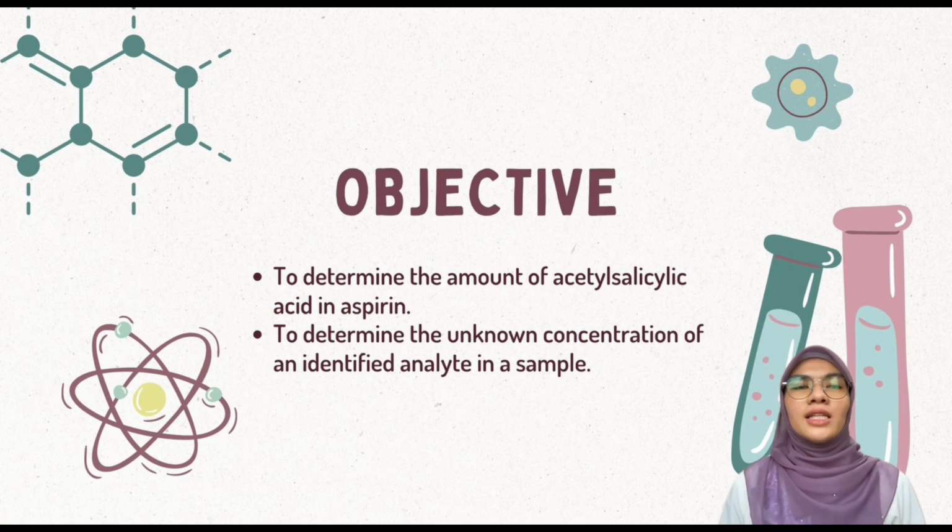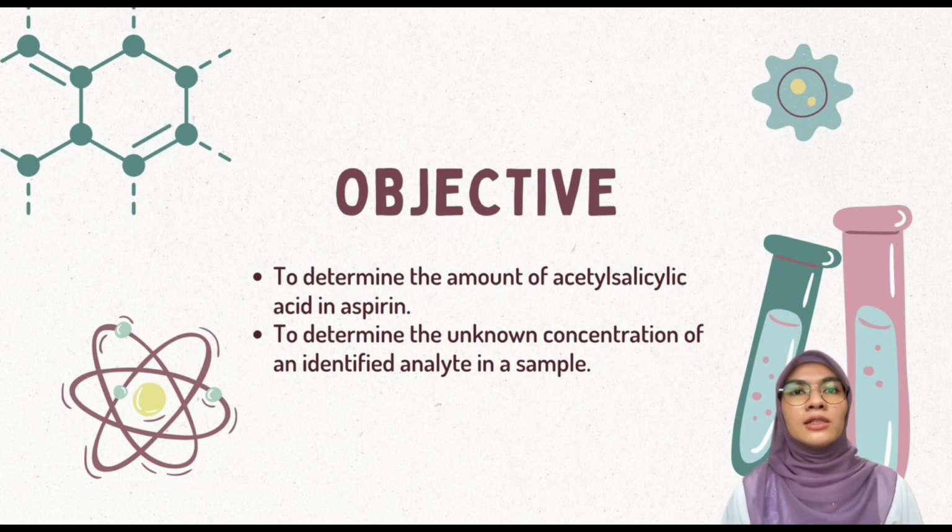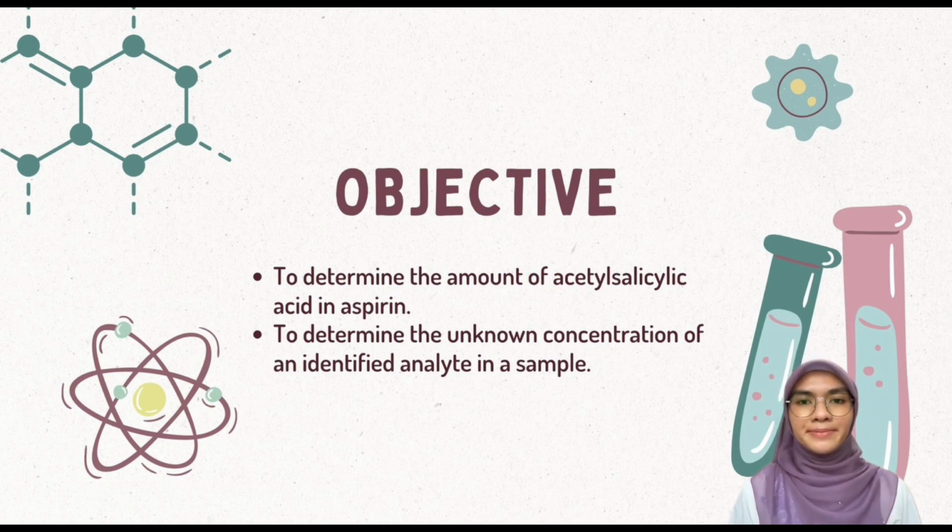So the objective for this experiment is to determine the amount of acetylsalicylic acid in aspirin and to determine the unknown concentration of an identified analyte in a sample.